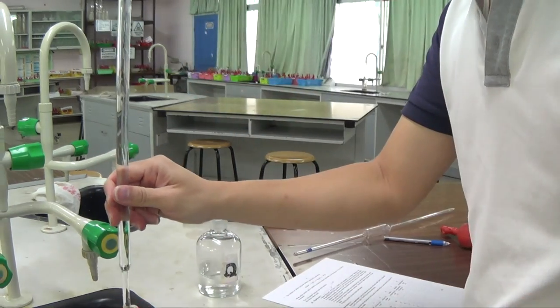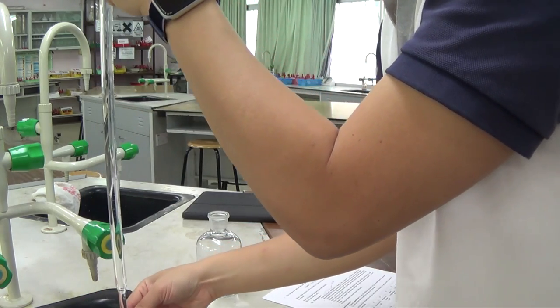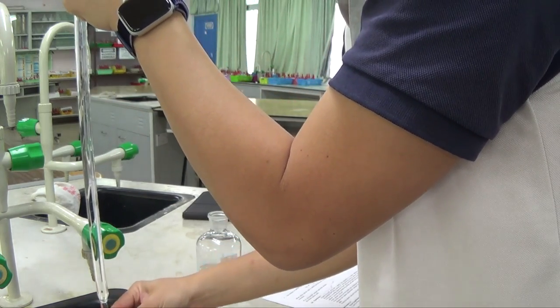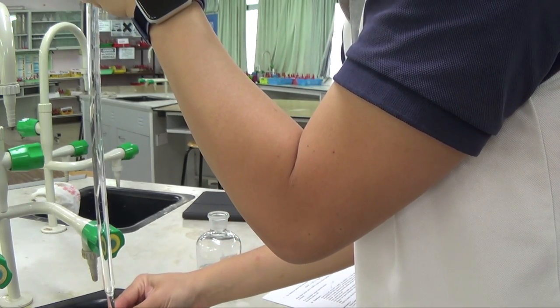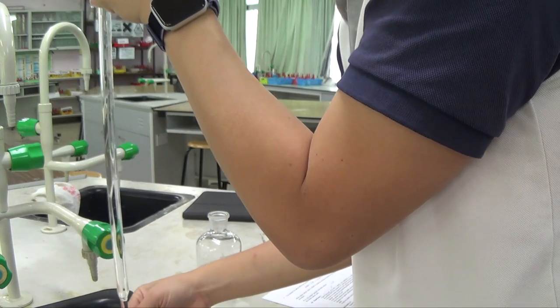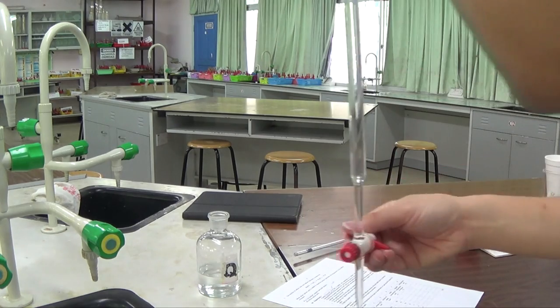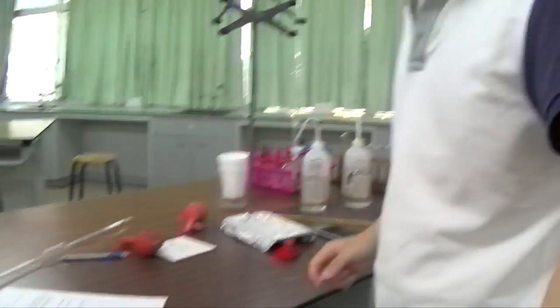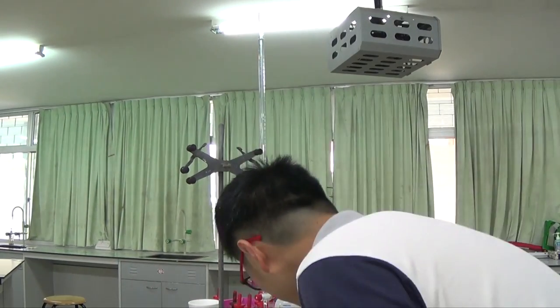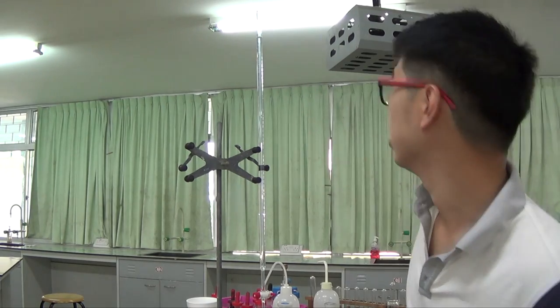You can't see it now, but I am holding it in my hand and slowly opening the tap to try to get it to 0.00. So that is 0.00 cm³. Close the tap and then put it back on the support here. Okay, so we are back here. I have my burette supported. That is 0.00.